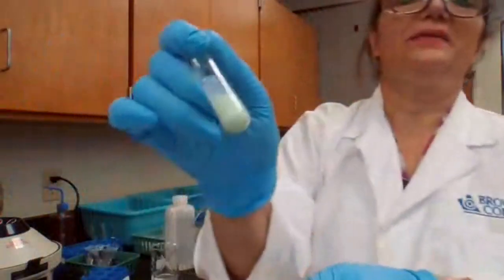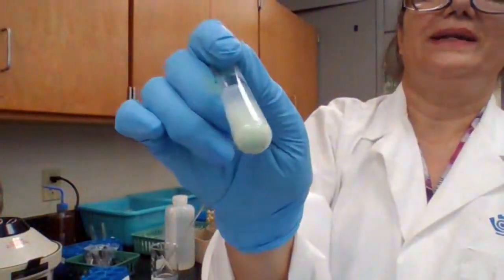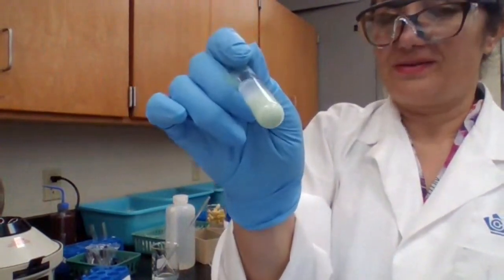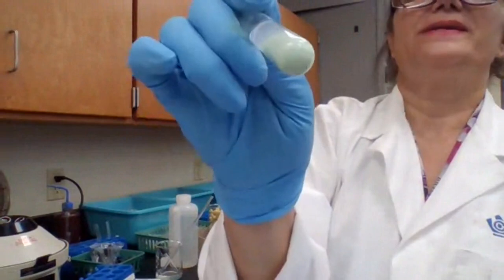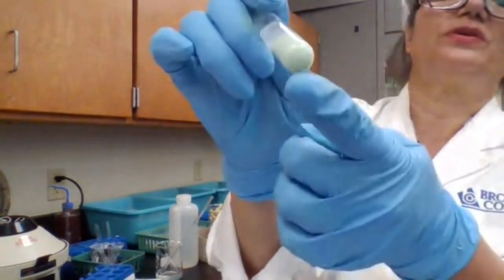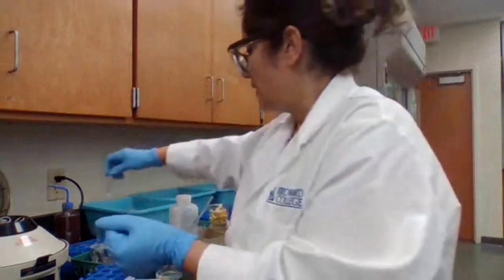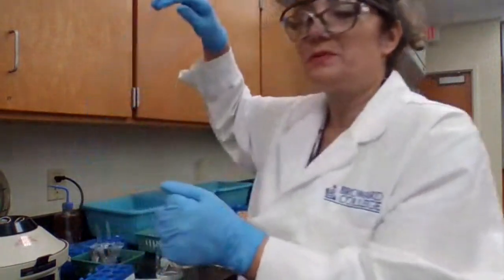It did settle down and I see the black particles. That's how I can omit the centrifuge. Otherwise, I have to centrifuge it in order to see it. But since I already see it, I don't have to centrifuge. Okay, I'm done with the bismuth part. The only thing I need at this point is to make sure that I have the copper confirmed.